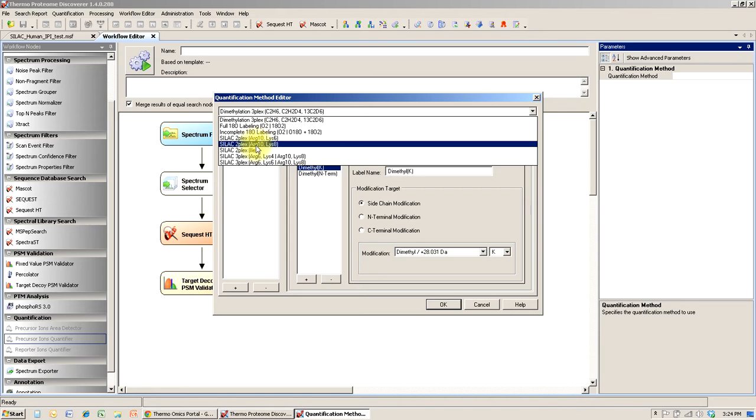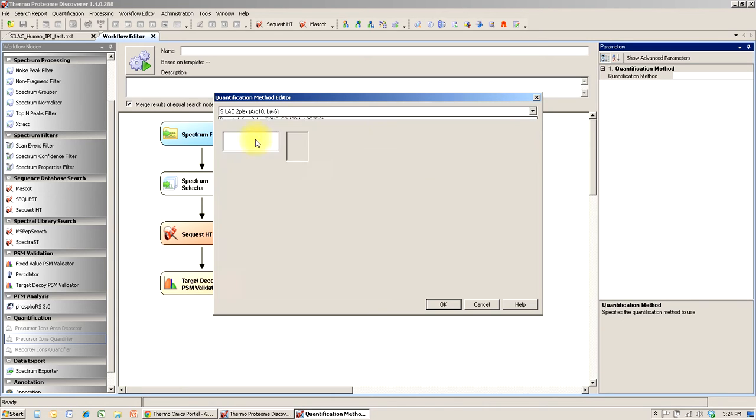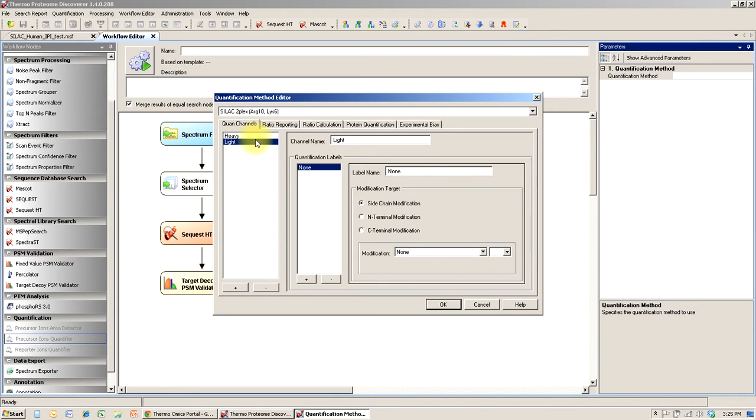In this case, we're going to be doing a very simple SILAC experiment. The most common, I think, is when the lysine is +6 and the arginine is +10. But all of the logic for this experiment can be carried over to these more complex and even less common experiments. But we'll just walk through this one here.